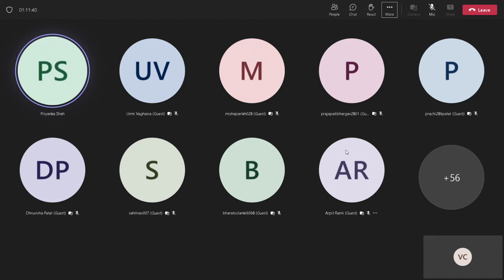On YouTube there are some videos available for separation of dyes, but those are on paper chromatography, not on TLC plate. Exactly as you have seen in the separation of drugs and amino acids, we'll do the same. We'll do this experiment in the same manner, but instead of amino acids and drugs, we will spot these dyes.